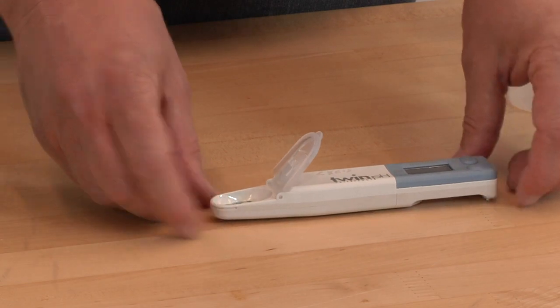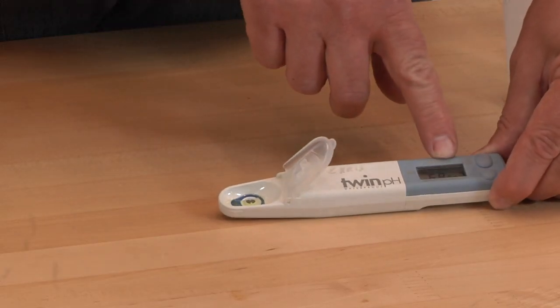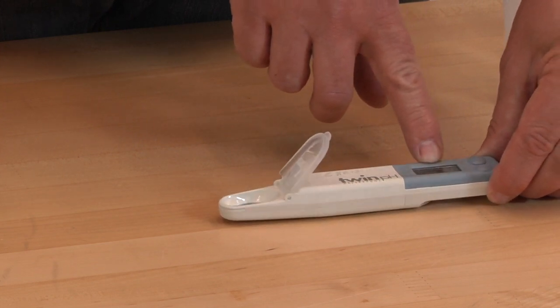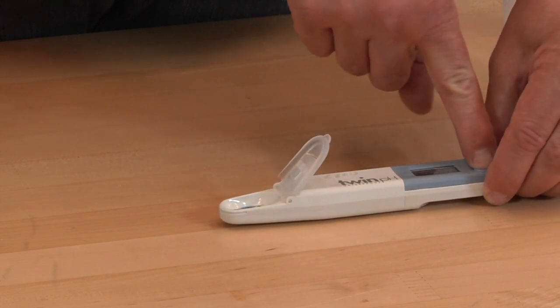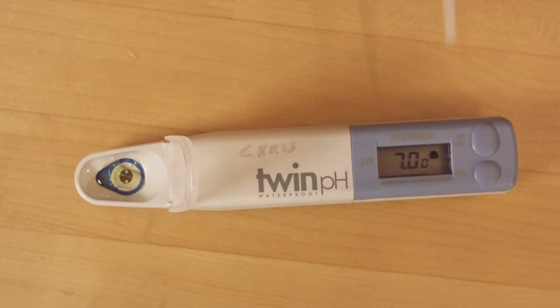So again, when we get a happy face, you can see that we're at 6.99. We want to calibrate to this, so we push the calibrate button. You can see we're calibrating to 7.00, and we have that little symbol showing we're in calibration mode. Now we just wait for the happy face, and we've done our calibration to pH 7.